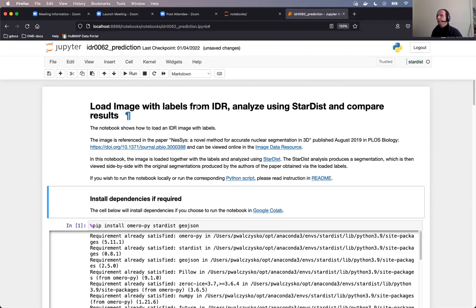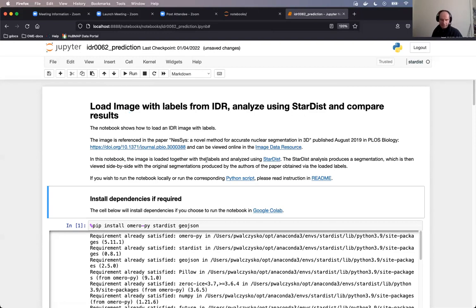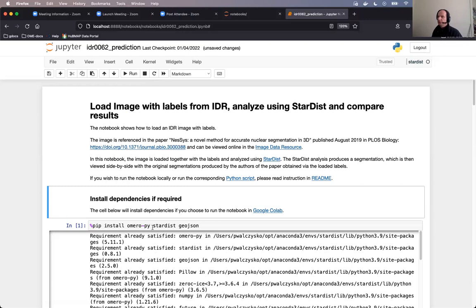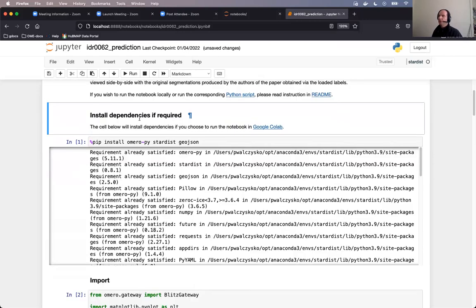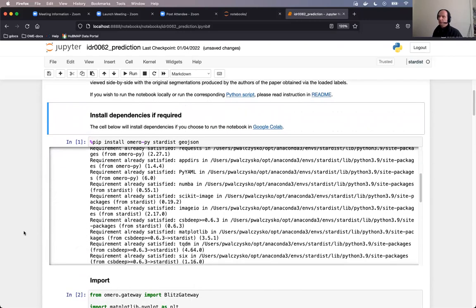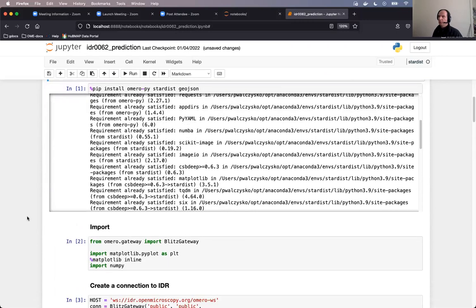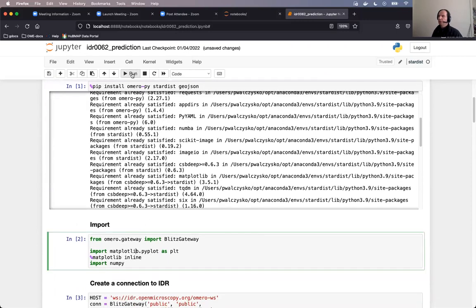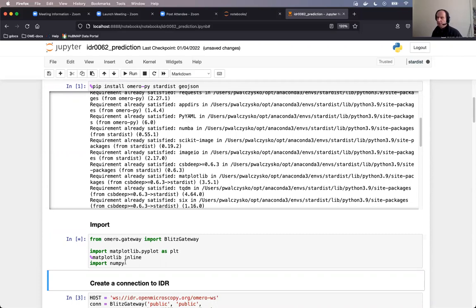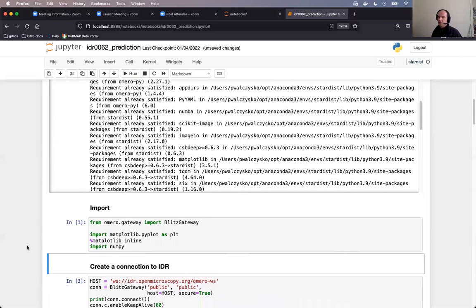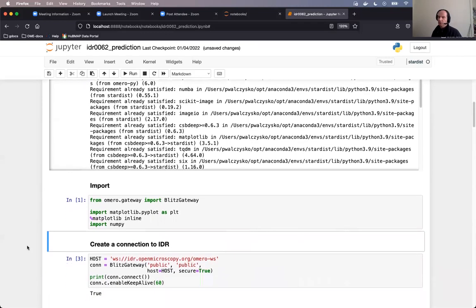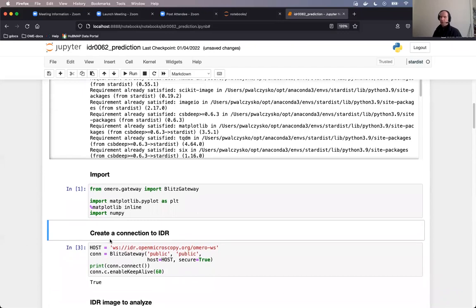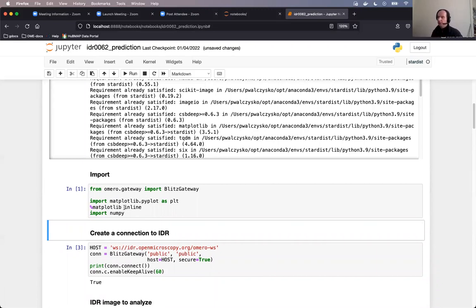So this notebook, as indicated on my slide, loads image with labels from IDR and uses Stardist. Stardist is the Python package, and we will segment the image from IDR, so to say, second time. First time it was segmented by the authors who did not use Stardist. This cell does not have to be run if you are not using Google Colab, so I will skip it because I'm using the conda way, and I will import some packages. NumPy is an important Python package for scientific computing, and it gives you a tool of NumPy array, which is an array capable of storing binary image data.